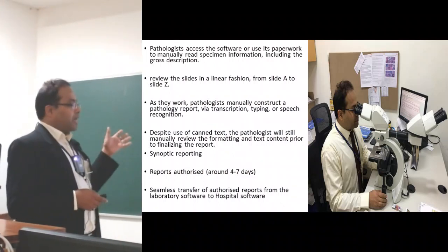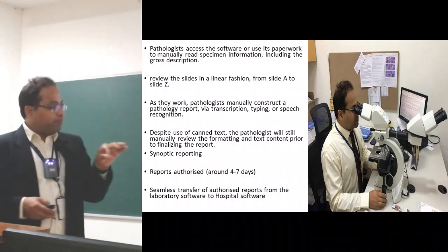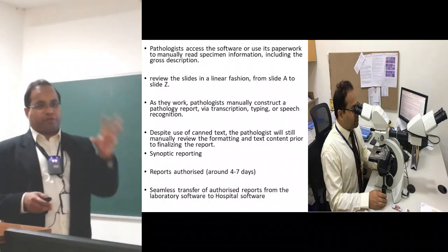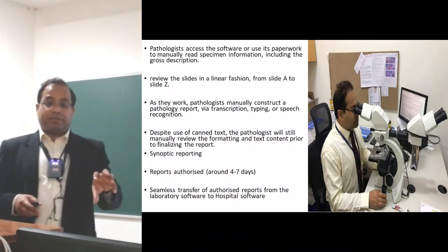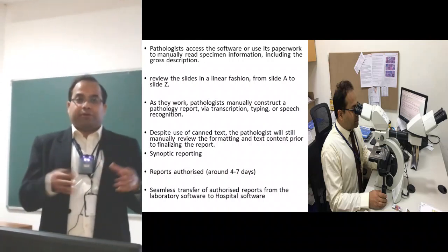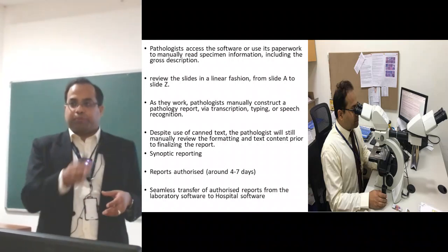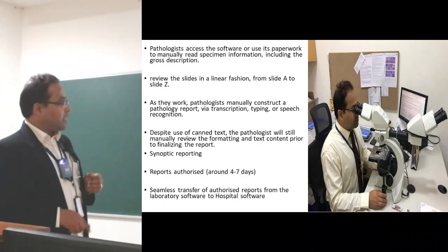Once I authorize the report by pressing the authorize button on my computer, there is a seamless transfer of that authorized report from the laboratory software to the hospital software. We don't have to carry reports to the other departments or the OPDs. They can look up the computer and have a look.